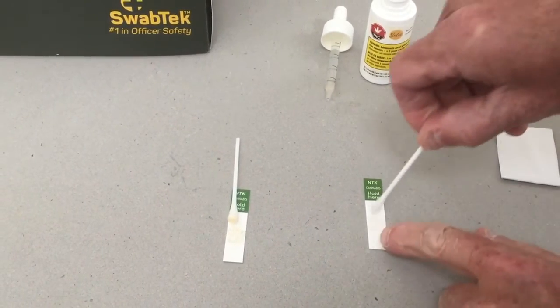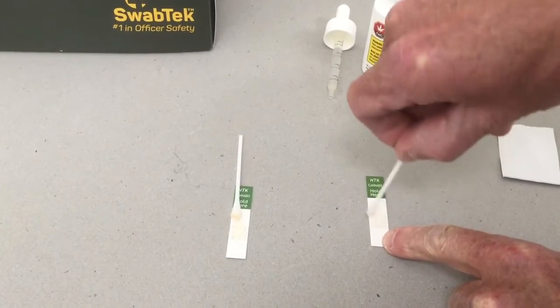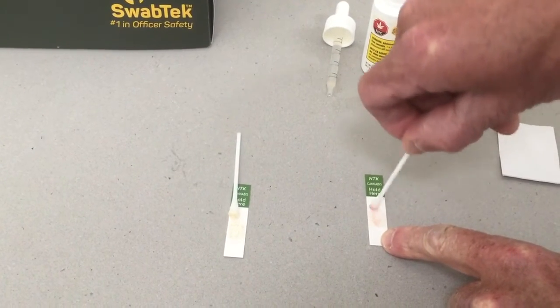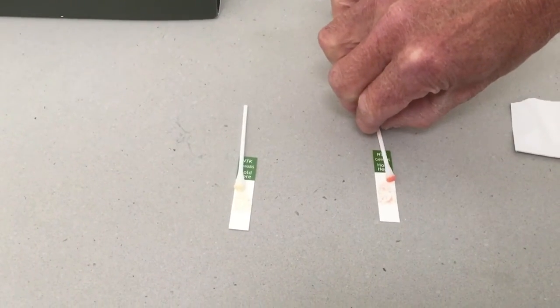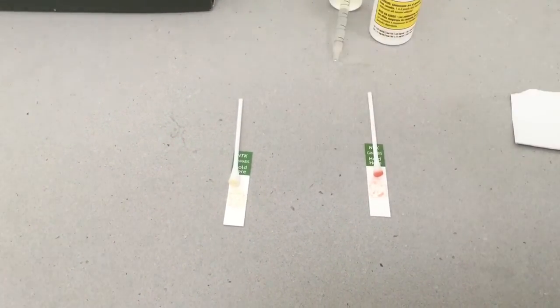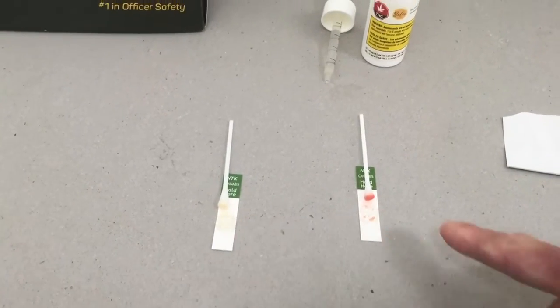There's a suspicious liquid, and we dab it onto the actual test kit and we start getting an indication. And that's a positive indication for cannabis product containing cannabinoids and THC. So you can see the direct comparison.